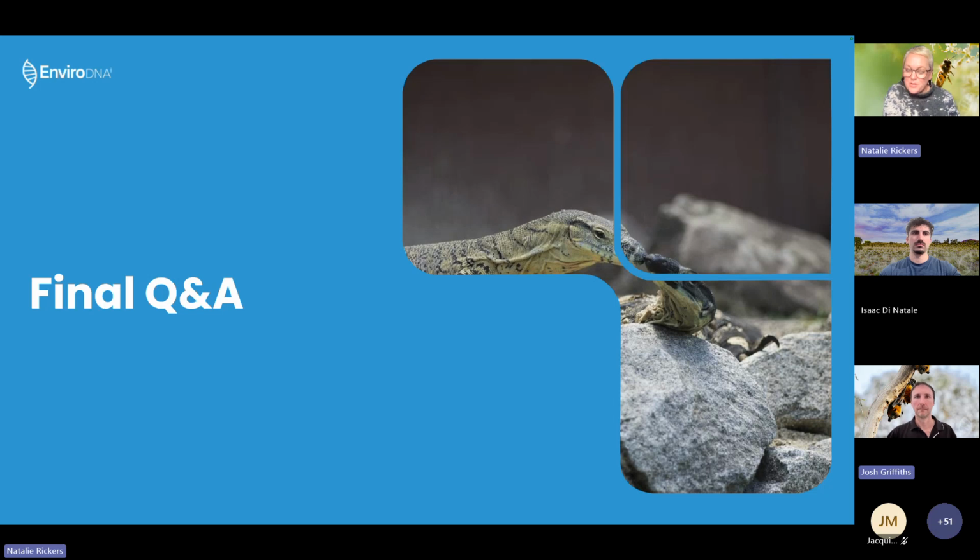Awesome. I might get Isaac to answer this question. It's a great one. If an eDNA soil sample for a flying insect species is negative, but the plant swab sample is positive, does that indicate that the species is just landing on the plants, but not necessarily breeding in those sample soils? Tricky one.